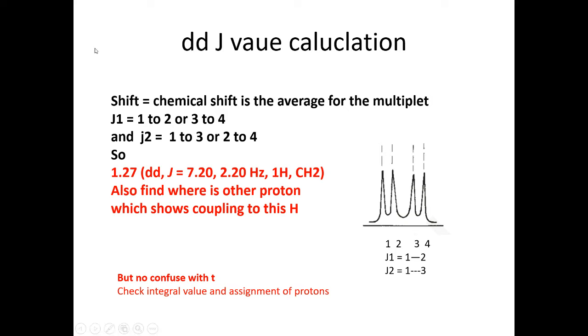So we write down for this doublet of doublet the two J values. If the J values are the same, like 7.21 and 7.20 Hz, then we write it as we discussed in a separate lesson, which has an apparent triplet having different chemical shifts of two protons.